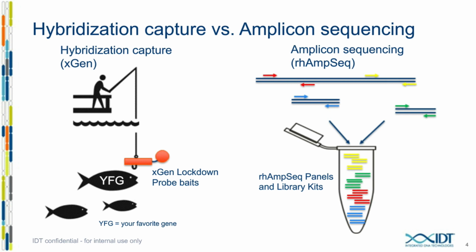Moving on, the advantages of running capture are that it's a more accurate representation of your original DNA sample. It's better for larger target spaces. Because we perform adapter ligation during library preparation, we can build in error correction through the addition of UMIs. And generally, we get a higher degree of uniformity with hybrid capture. Some of the disadvantages of hybrid capture are that the protocol is pretty long. IDT's is one of the shorter protocols, and it lasts around 9 hours. There are variable results for smaller panels under 1,000 probes. And if you're only running one capture per sample, then it can be more expensive.